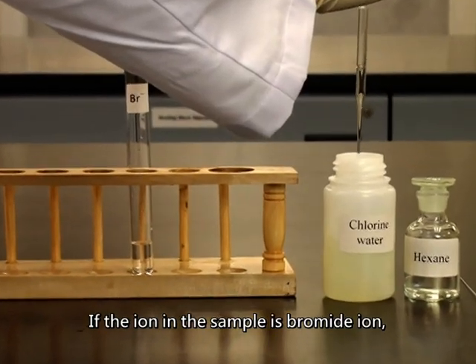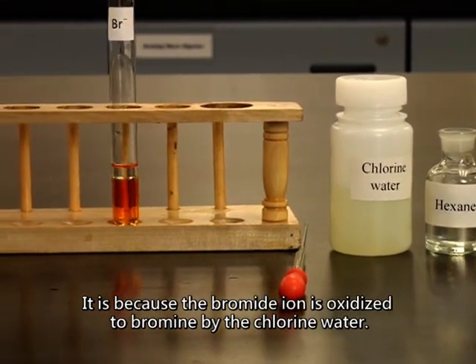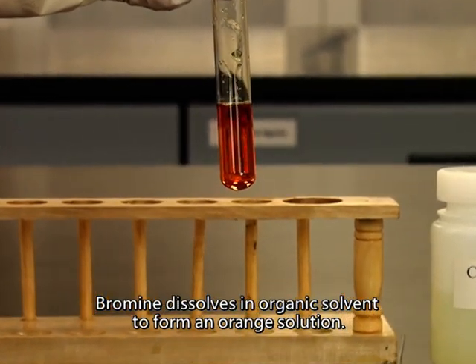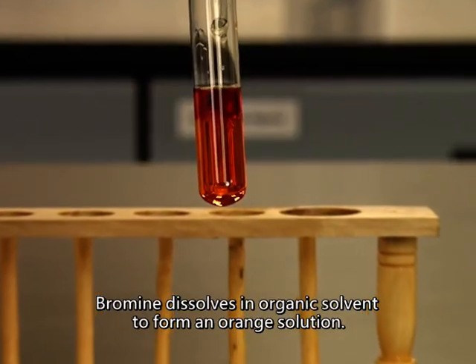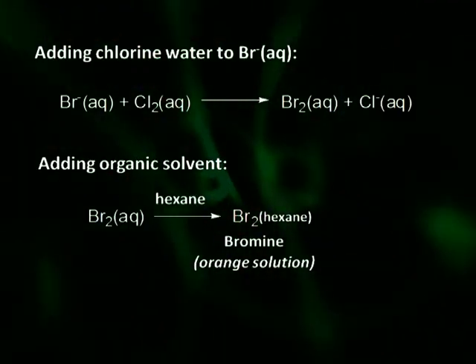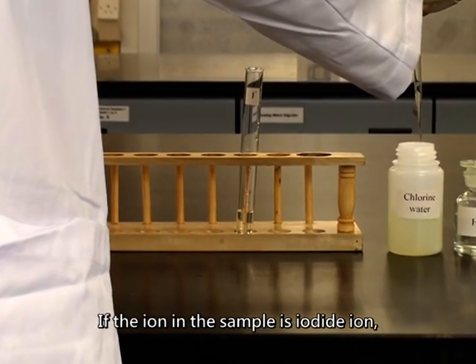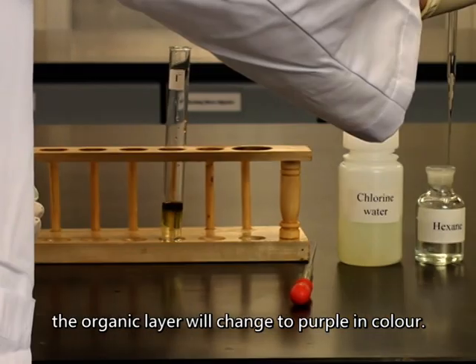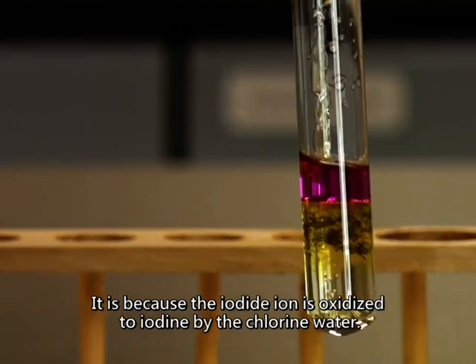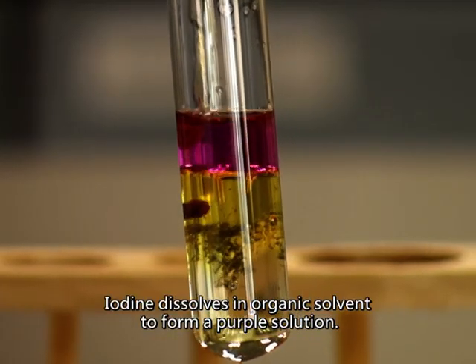If the ion in the sample is bromide ion, the organic layer will change to orange in color. It is because the bromide ion is oxidized to bromine by the chlorine water. Bromine dissolves in organic solvent to form an orange solution. If the ion in the sample is iodide ion, the organic layer will change to purple in color. It is because the iodide ion is oxidized to iodine by chlorine water. Iodine dissolved in organic solvent to form a purple solution.